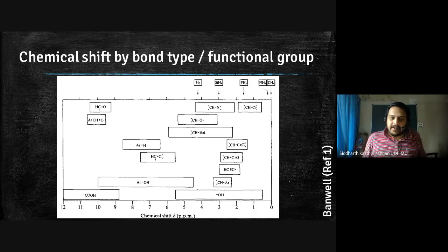If you have a mass spectrum, then you know, because 8 carbon atoms means each carbon atom has mass 12. So 8 carbon atoms means the mass will be around 96, that is around 100 or so. On the other hand, if there are only 3 carbon atoms, then the mass will be close to 36 or something like that. So you can pinpoint the structure if you have the mass spectrum also.